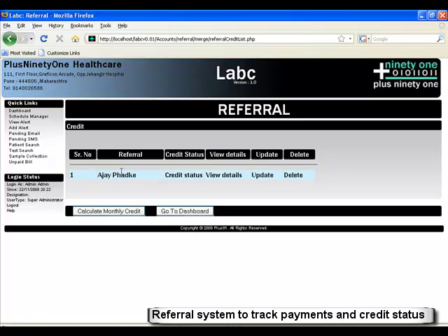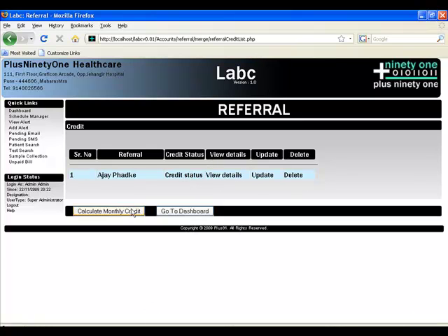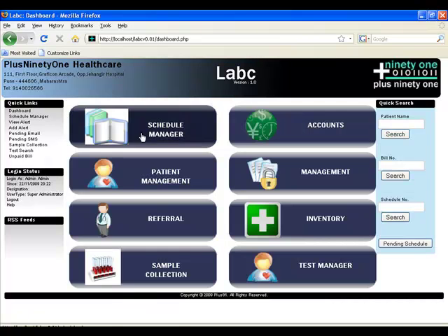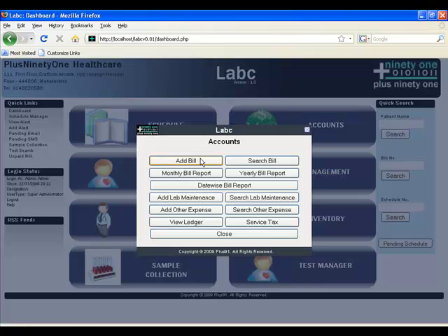LabC also manages referrals very easily. You can add referrals as well as their value for each test that they refer. It also gives you a complete credit status between two dates, and you can make payments directly from here.